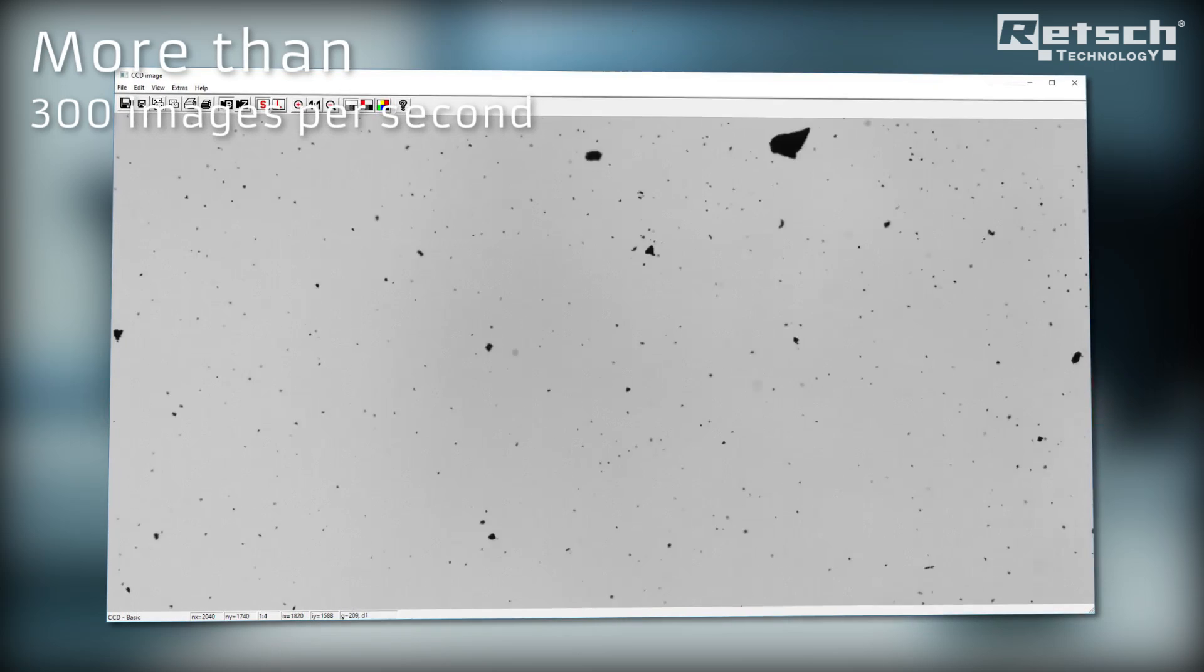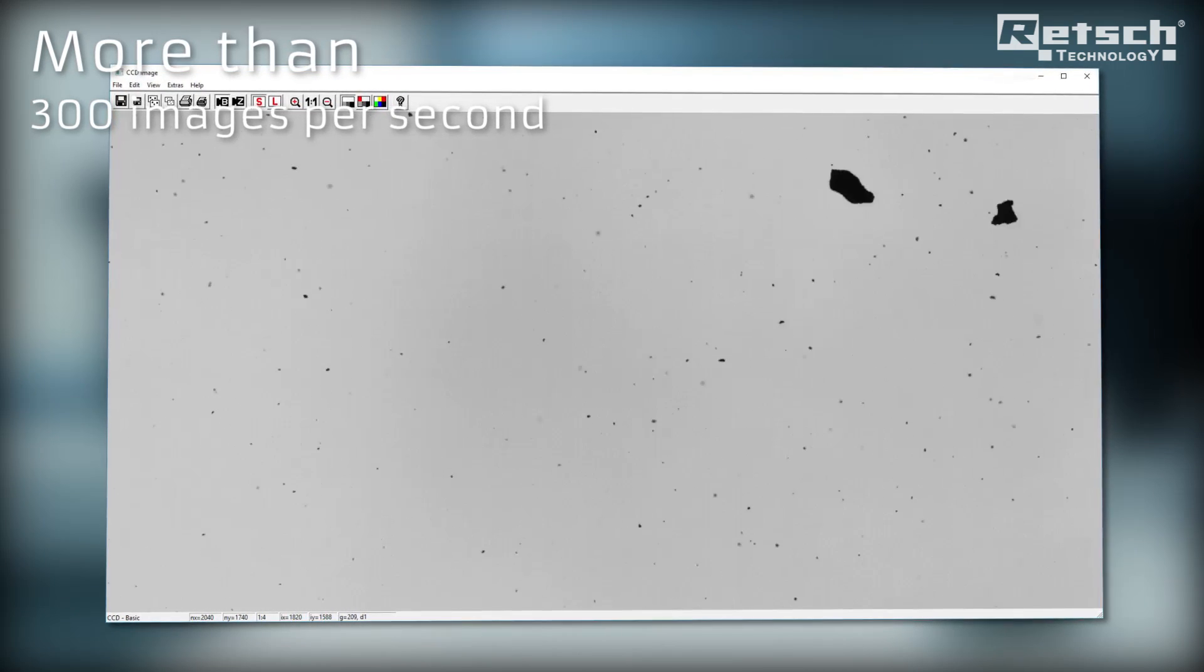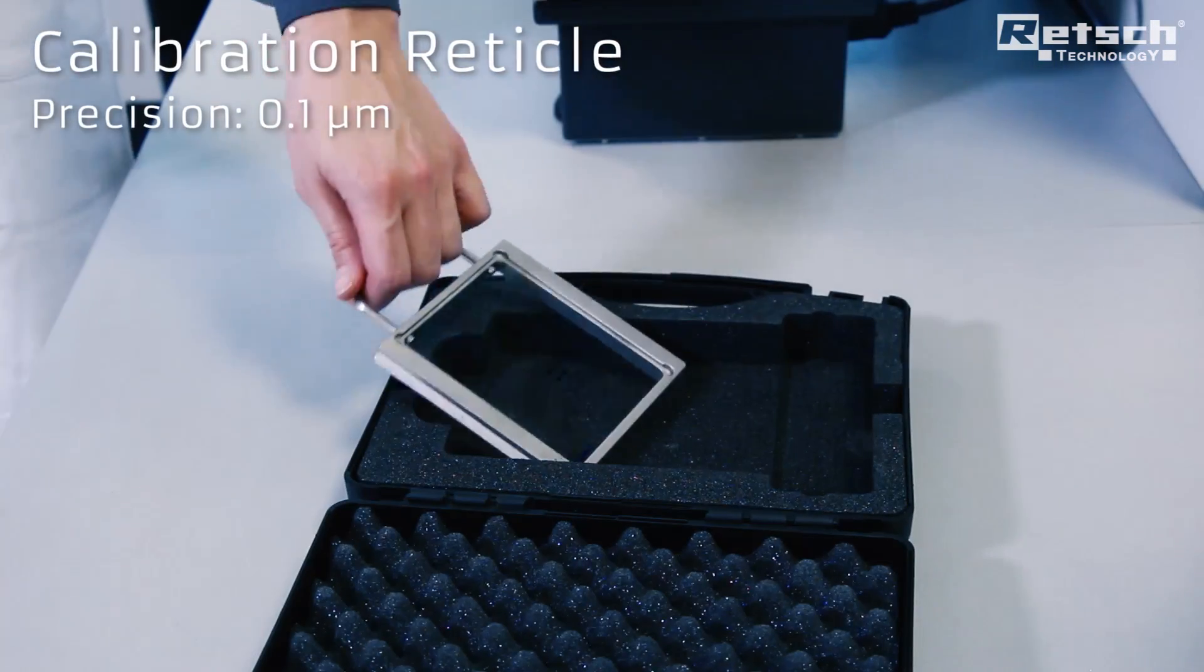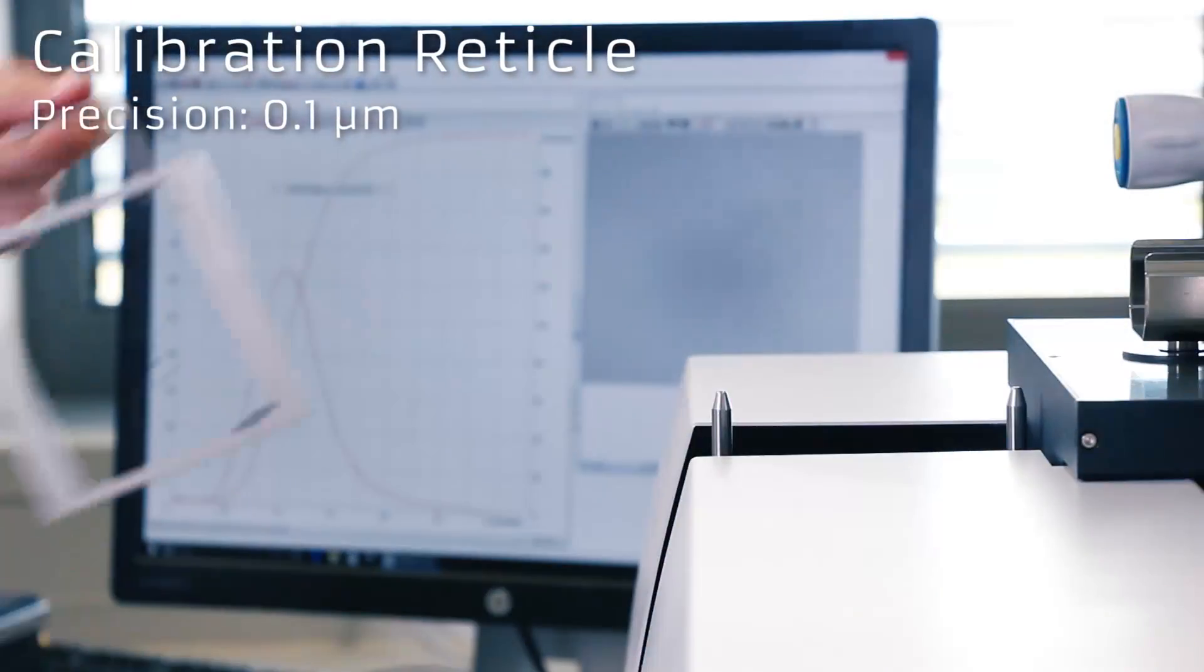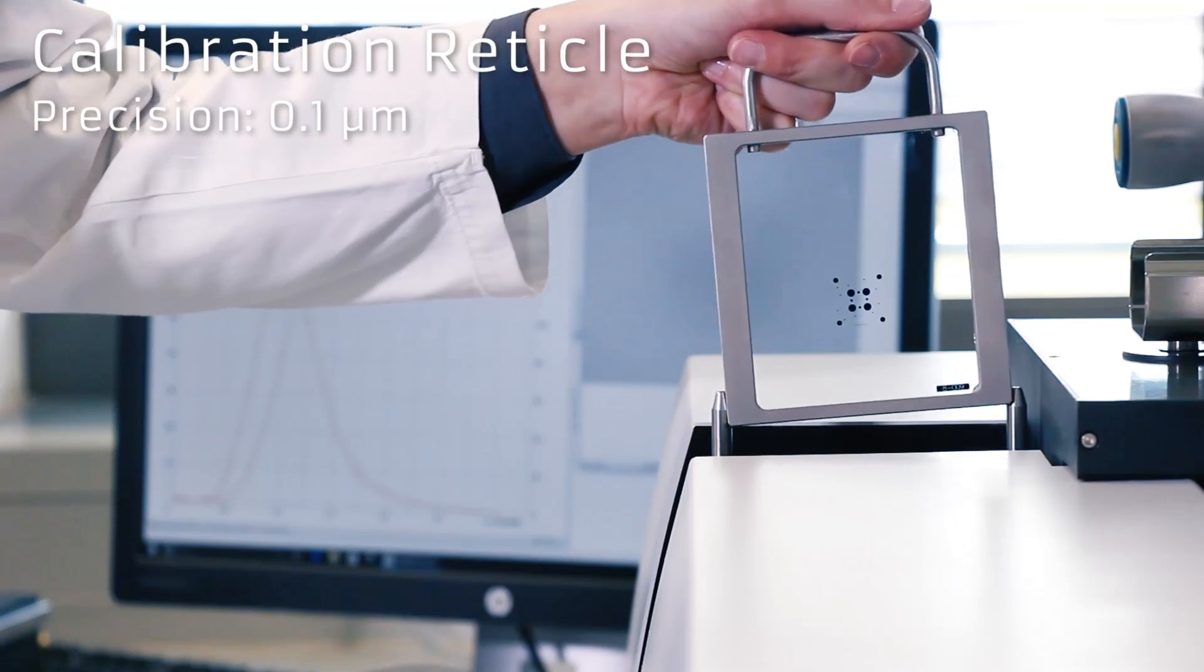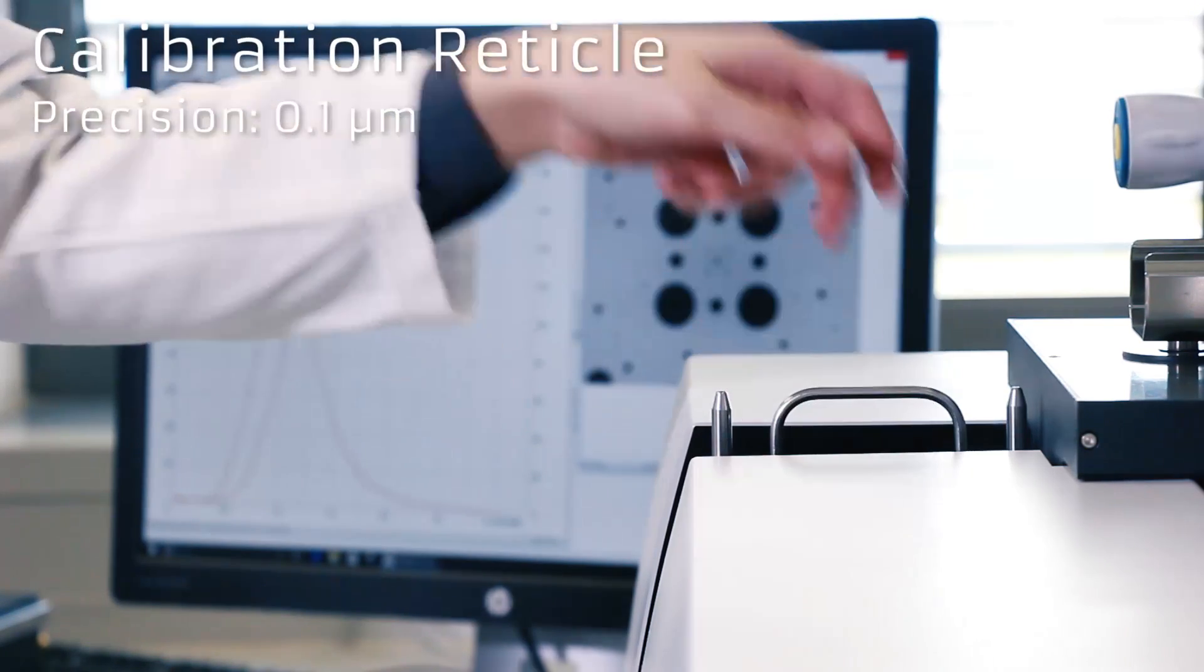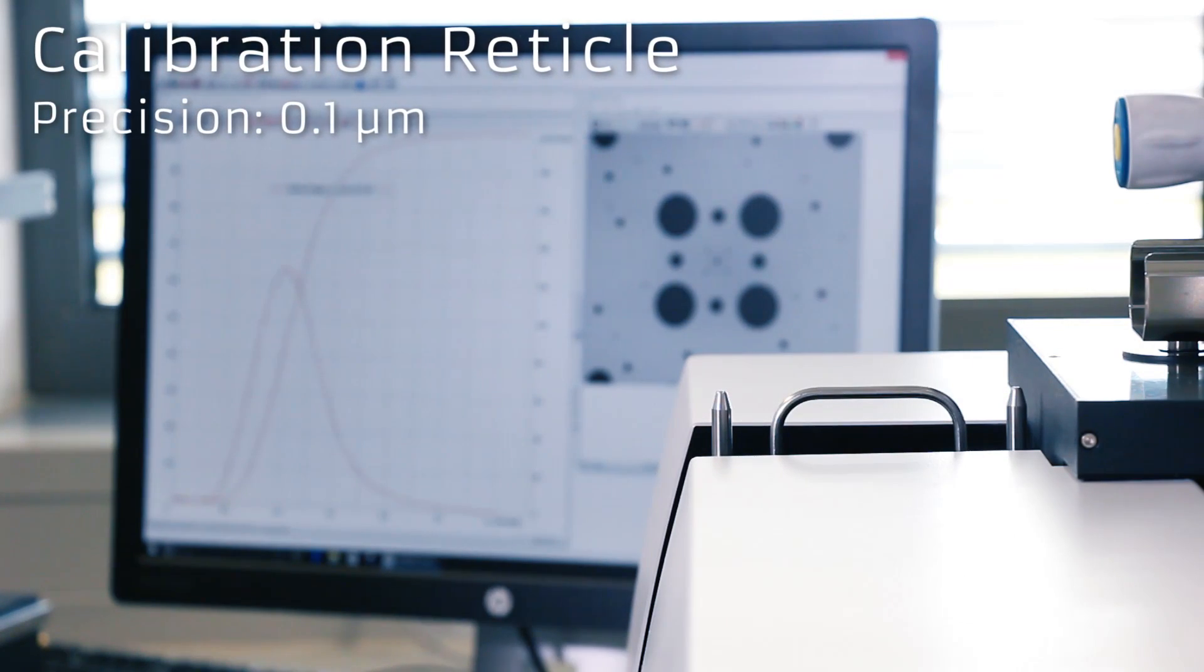The system records more than 300 images per second, with each image containing several hundred particles. The magnification of the cameras is determined by using a calibration reticle with a precision of 0.1 micrometers. Recalibration of the instrument can be done any time within a few seconds.